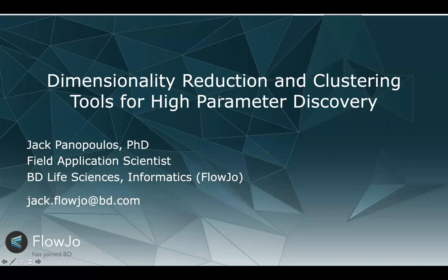And we'll have an emphasis today on how to compare categorical variables or categorical parameters. I will walk you through a couple of slides just to describe what we're going to do today. And then afterward, we're going to go into a live demo and I'll show you how we can create categorical variables and then use them to make comparisons between those variables in a high dimensional workflow.